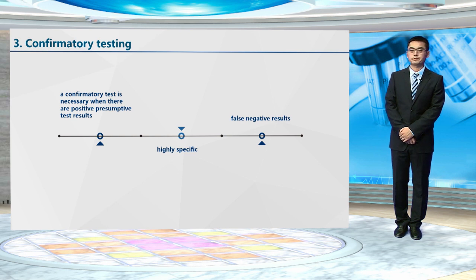What's more, the crystal tests have been shown to be highly specific. It should be noted that false negative results may be obtained from old bloodstains and blood on materials, such as tannic acid-treated leather.